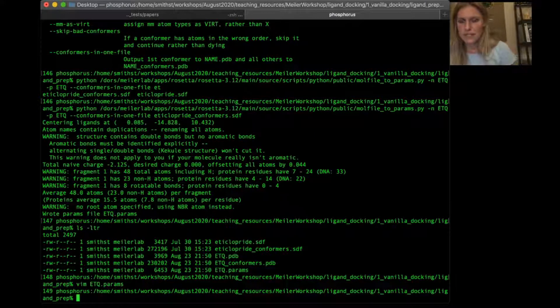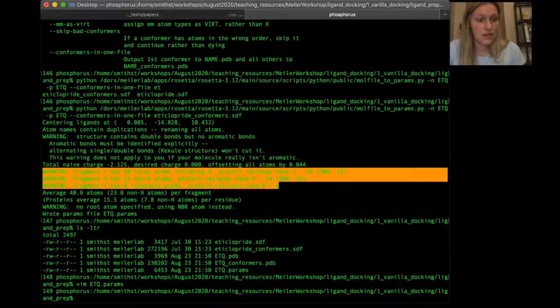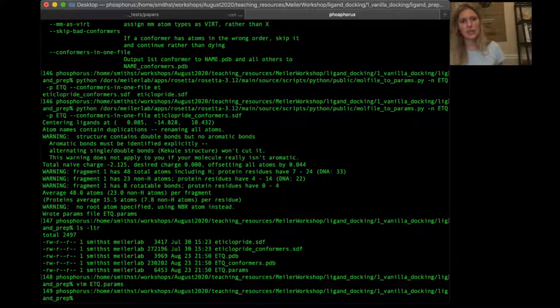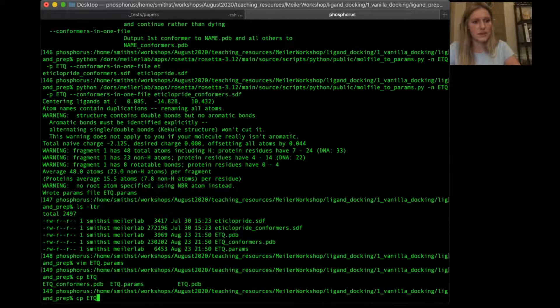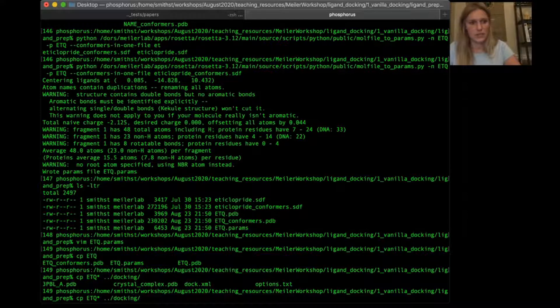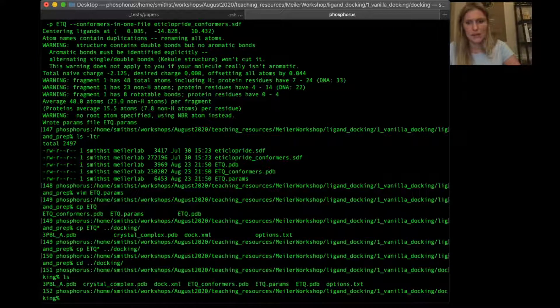You may encounter a warning about number of residues — that's totally fine and normal, don't worry about it. We've already looked at the etq.params file; look for that PDB_ROTAMERS property in the last line. We're going to copy all of these ETQ files into the docking directory, where we already have our clean PDB starting crystal structure and a couple of other things I'll get into in a moment.